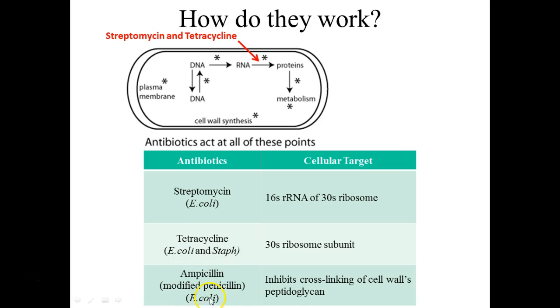Ampicillin, as I said, is a modified penicillin, and so this one can actually enter in past that outer membrane of the gram-negatives, and you'll see that it was sensitive to ampicillin on our plates, right? If you see there you actually had a zone, you're actually able to measure it. It's within the sensitive range. We're going to use E. coli and ampicillin later on in the semester. This is one of the main reasons that I make sure that we do it in this procedure, so that you guys can see that normal E. coli is sensitive to ampicillin. We, on the other hand, are going to make in this lab ampicillin-resistant E. coli. Okay.